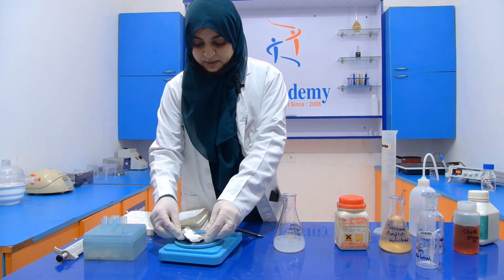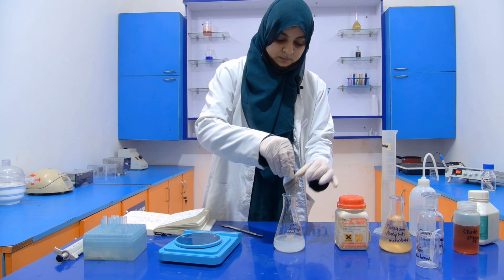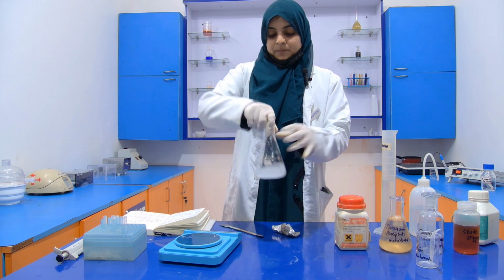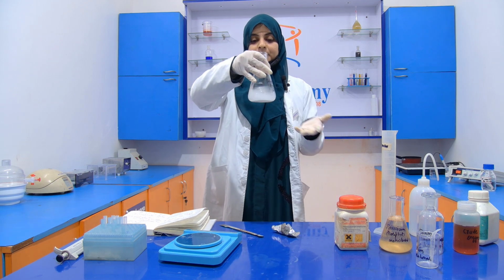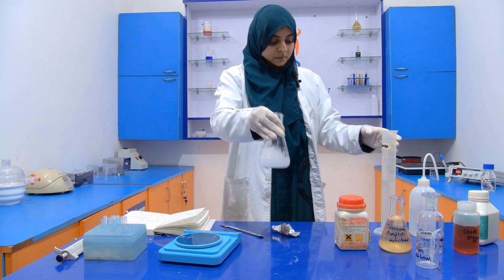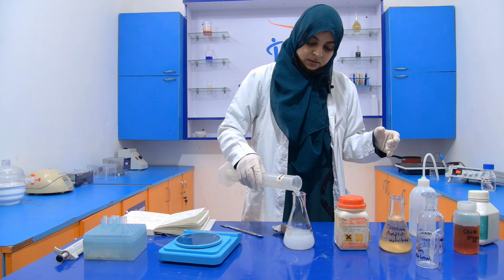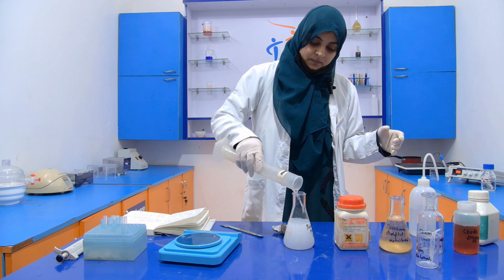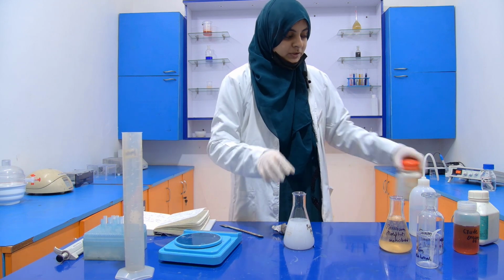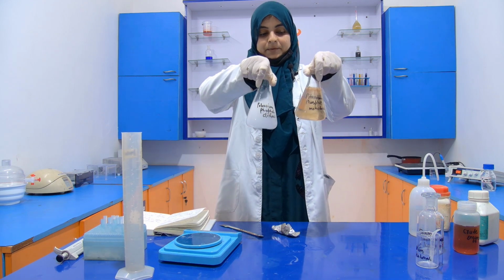Now I'm going to add this dibasic into distilled water. Now mix it properly so that it will completely dissolve into the distilled water. When it is completely dissolved, the remaining distilled water will be added into a flask. Now our two solutions, that is your monobasic and the dibasic, are ready.